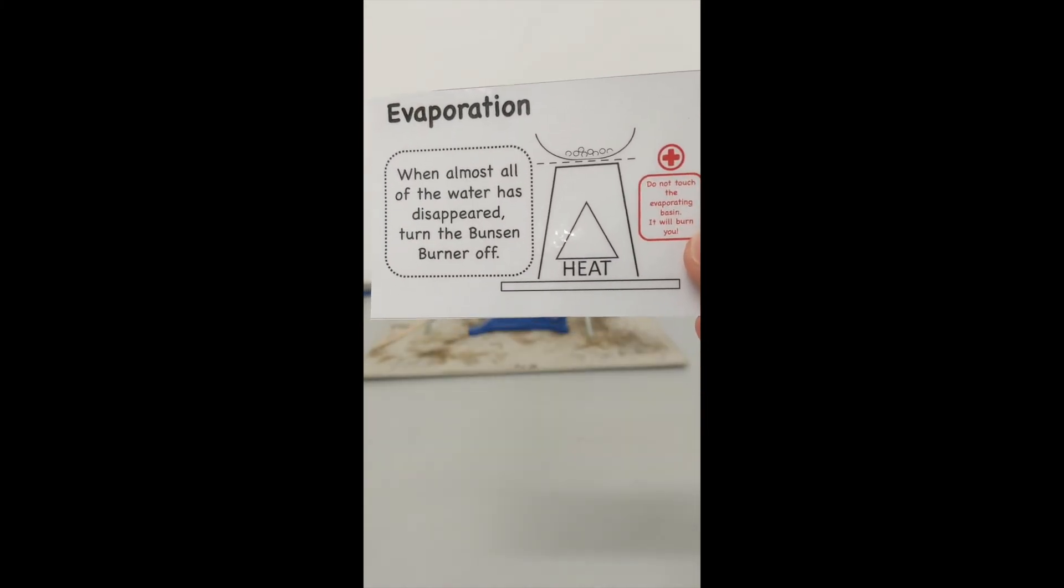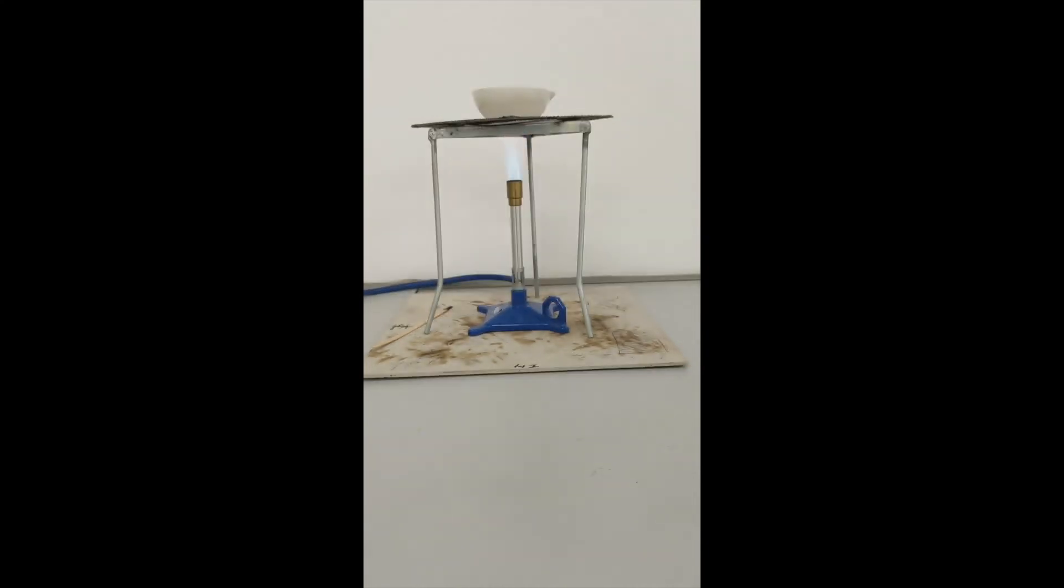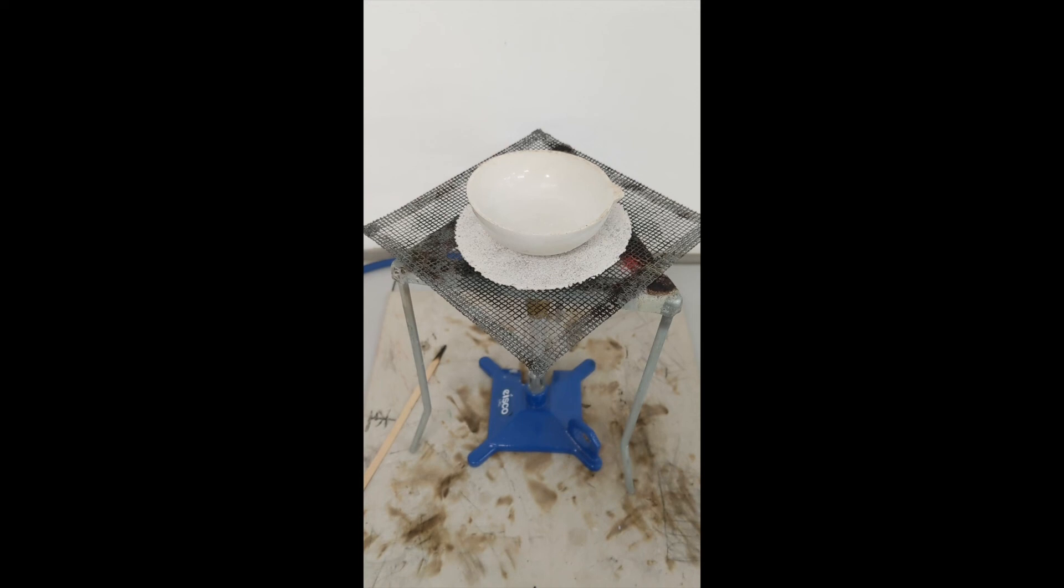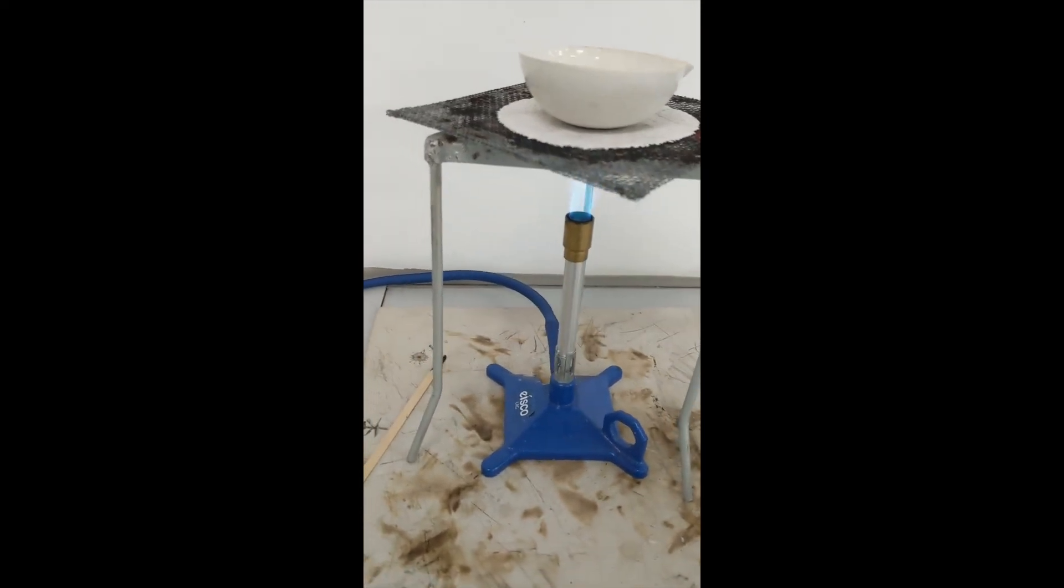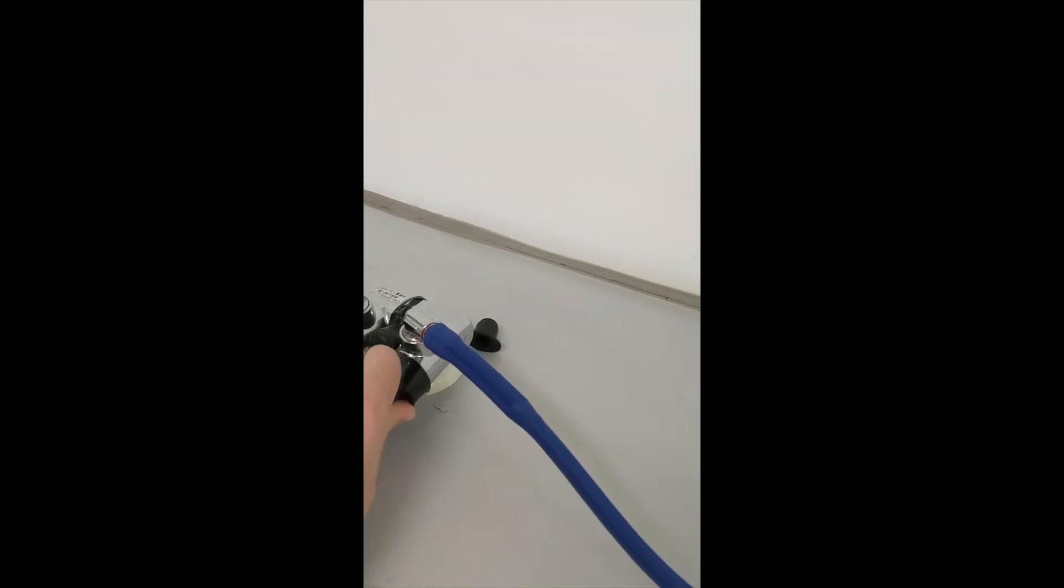When almost all of the water has disappeared, you can turn the Bunsen burner off. Turn it off at the gas tap. Almost all of the water has disappeared, so I'm going to turn the Bunsen burner off at the gas tap.